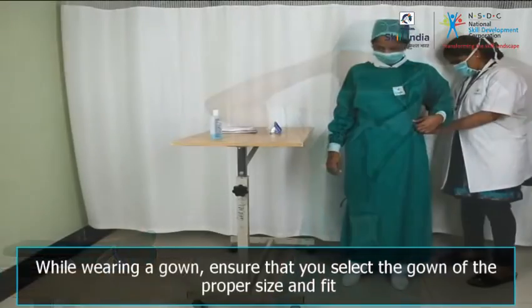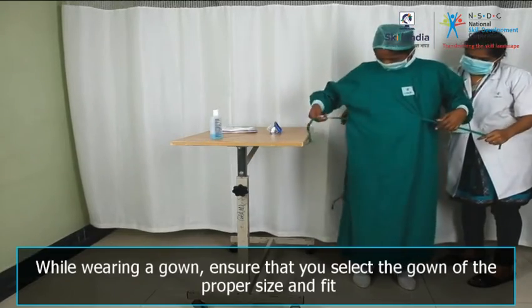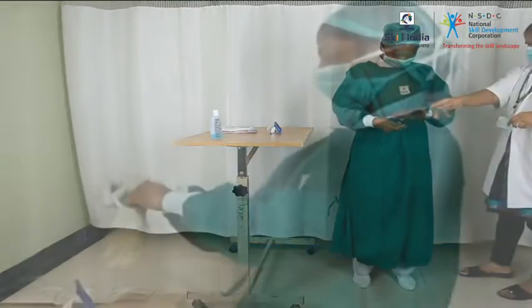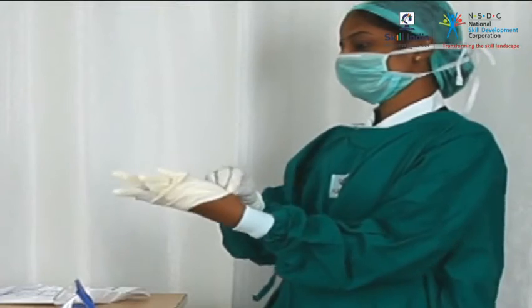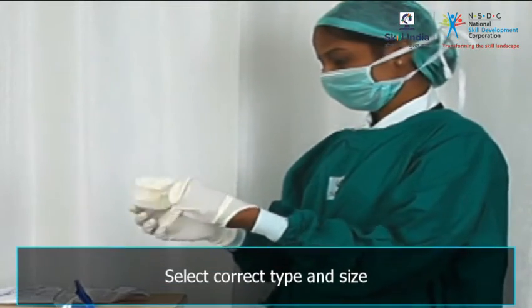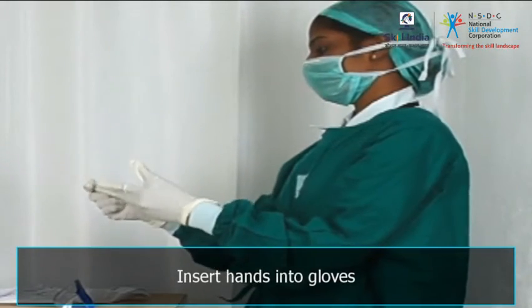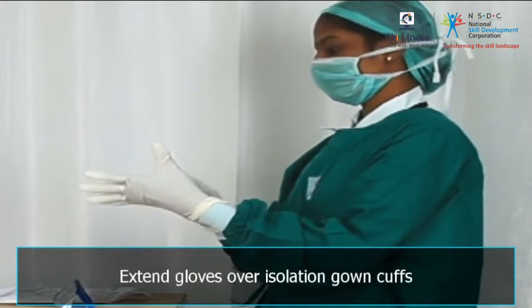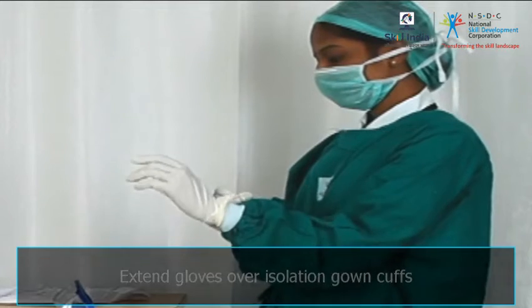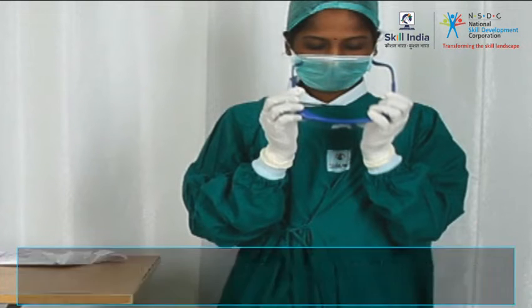While wearing a gown, ensure that you select the gown of the proper size and fit. Wear gloves in the following sequence. Select correct type and size. Insert hands into gloves. Extend gloves over isolation gown cuffs. In case you need to use a respirator or goggles, wear them after putting on the mask.